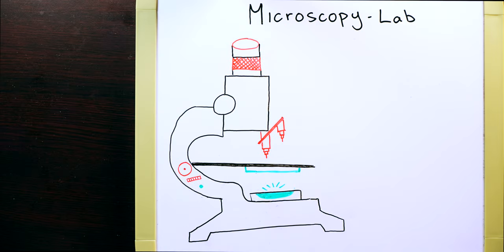Hello everybody, my name is Fritz and in today's video we'll be going over the microscope that you'll be using for your microbiology lab.